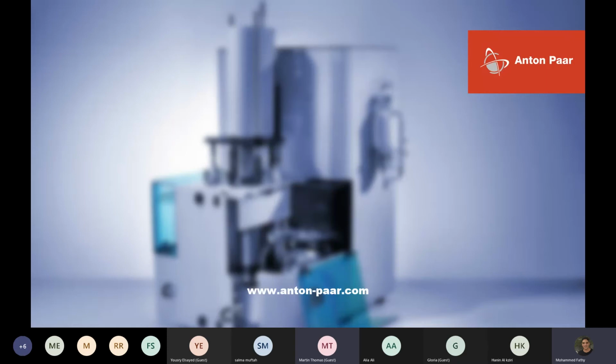Don't forget, it's well enclosed, the cabinet surrounds it, and with the fan running it should be pulling air through. But when the penetrometer cell is taken from the low pressure station, there's mercury in the capillary, so there's a tiny meniscus exposed.